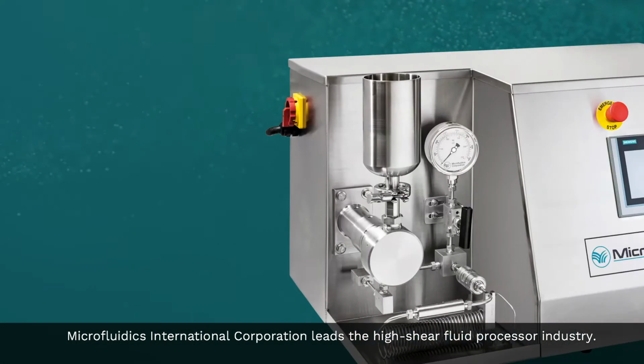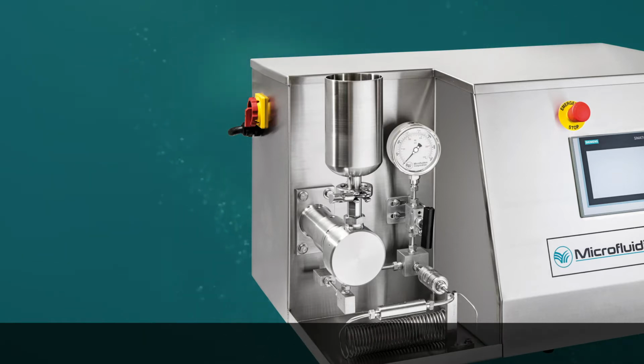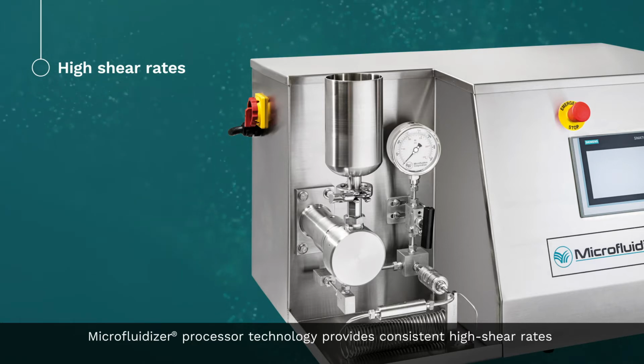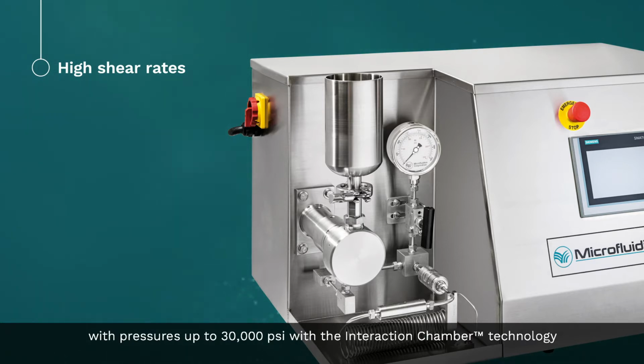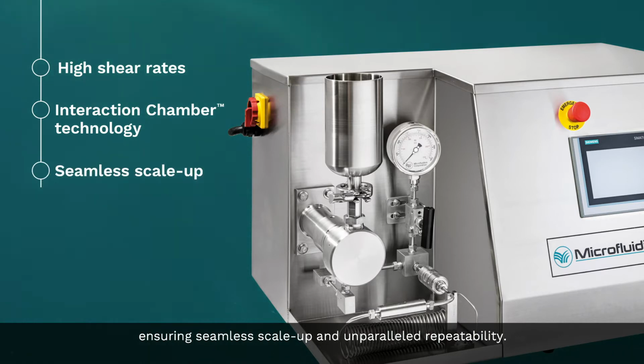Microfluidics International Corporation leads the high-shear fluid processor industry. Microfluidizer processor technology provides consistent high shear rates with pressures up to 30,000 psi with the interaction chamber technology, ensuring seamless scale-up and unparalleled repeatability.